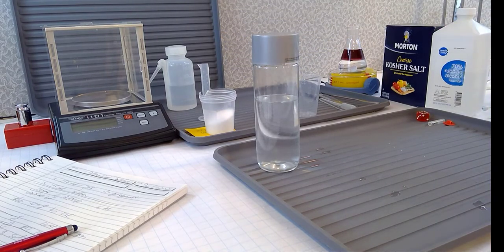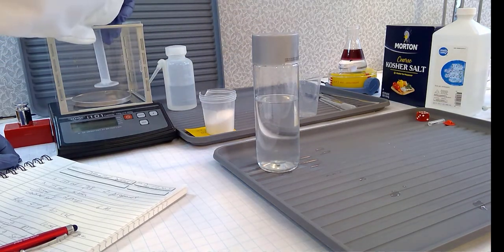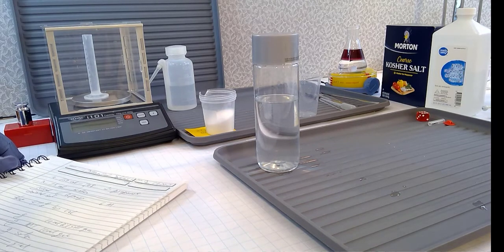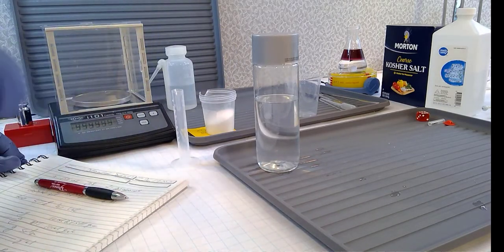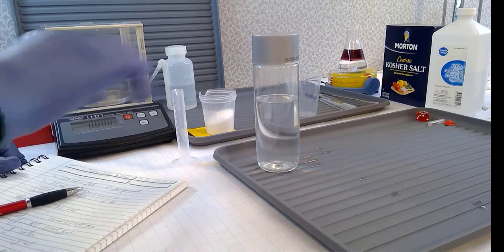Now we get to the quantitative part. I want to find out the density of this mixture. I'm going to have an empty graduated cylinder here, nice, dry, empty. Let's turn our balance on and make sure it sets to 0. I've got a draft screen here in case any drafts come by, and we're at 0, 0, 0.